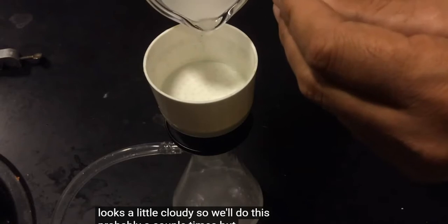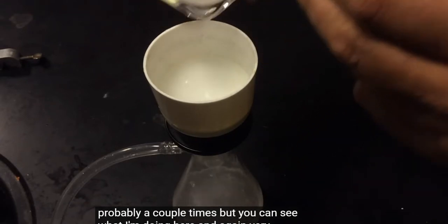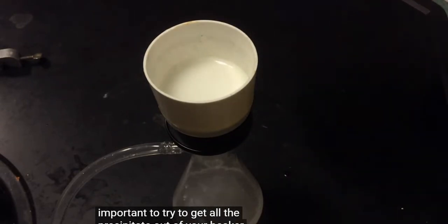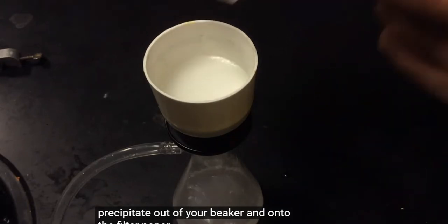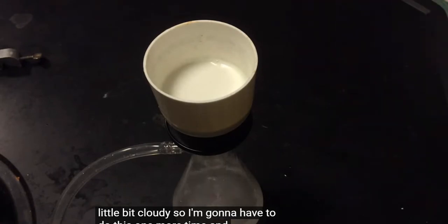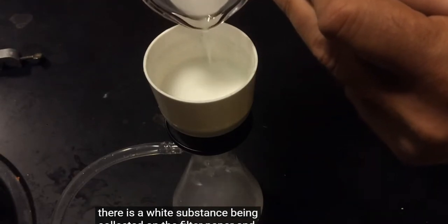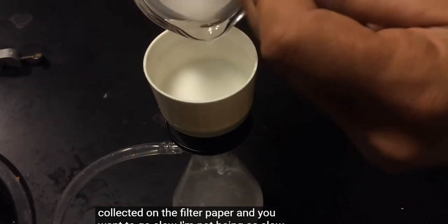See what I'm doing here. And again, very important to try to get all the precipitate out of your beaker and onto the filter paper. Again, my filtrate's a little bit cloudy, so I'm going to have to do this one more time. And you can see there is a white substance being collected on the filter paper. I'm not being as slow as I should be, as you can see in my beaker.